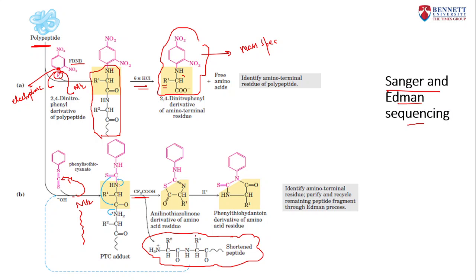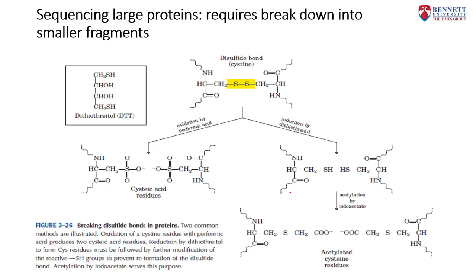Originally, let's say the protein has the size of N. This particular one would be N-1 because the terminal amino acid is forming an adduct. Similarly, if you do a mass spec, the side chain is present, so you can tell from the size what this adduct is. This is your N-terminal amino acid. So now we know how to find out the N-terminal amino acid. We need to get past one additional hiccup.